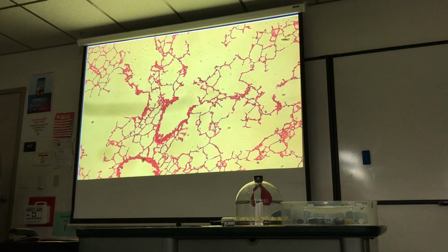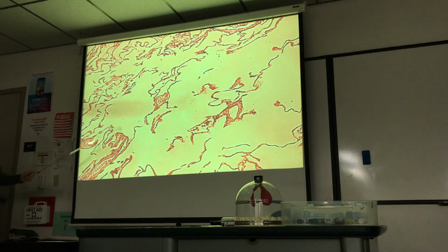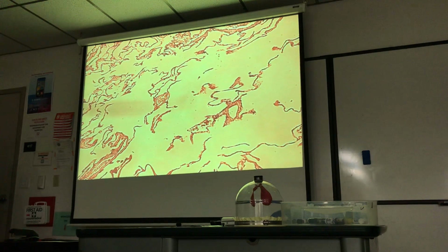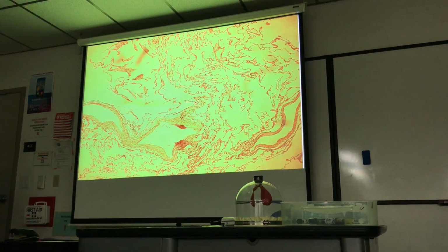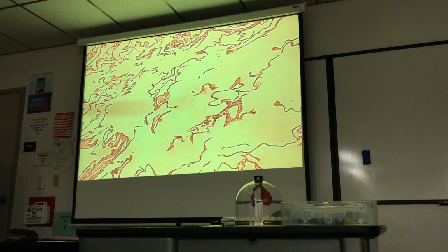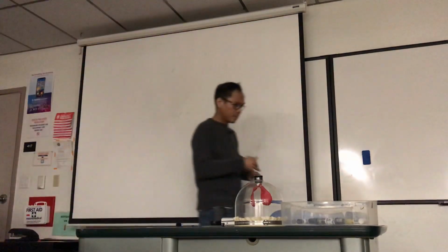This is normal lung. What is this? Emphysema lung, low mag, and a higher mag. We have fewer, larger alveolar spaces. This is definitely diseased lung. Once again, that's a lower mag of emphysema lung. That's a higher mag of emphysema lung. I think if you know that, you should do well on the quiz. Stop the slide.